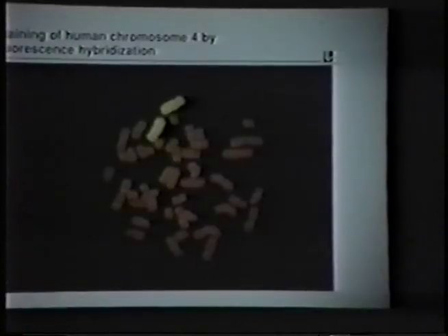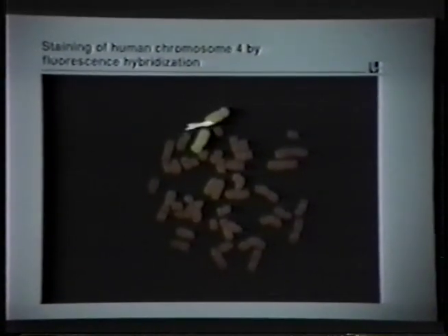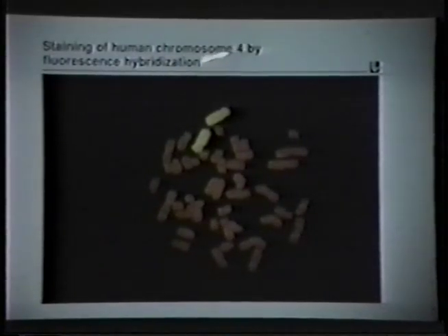using this technology. Now, another probe that is commonly used these days are the so-called whole chromosome probes. These are probes that are composed of a large number of different individual DNA sequences that are combined together from a single chromosome type, so that you can use these as a composite staining reagent. And here you can see hybridization with one of these whole chromosome probes for chromosome 4, staining almost completely the 2 copies of the number 4 chromosome in this normal human metaphase spread.